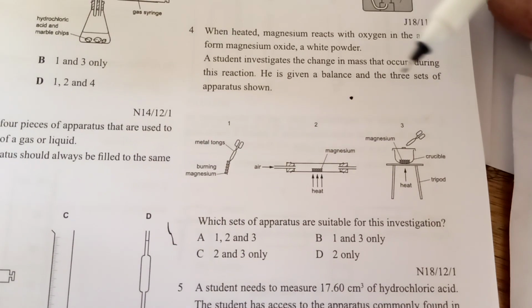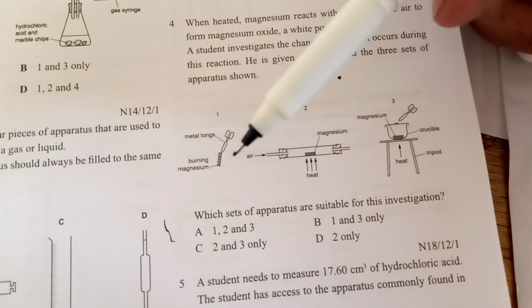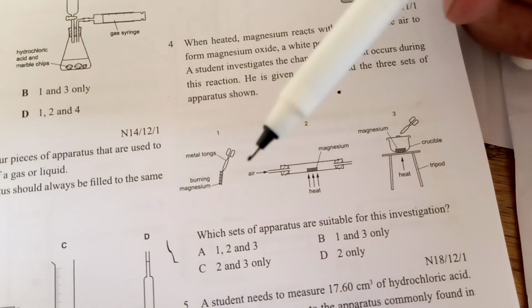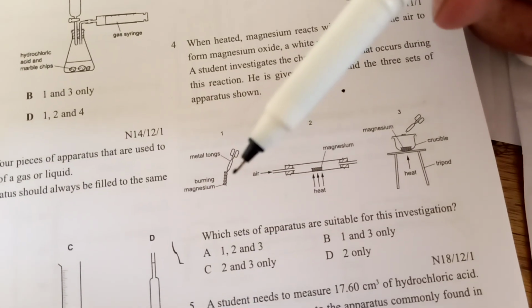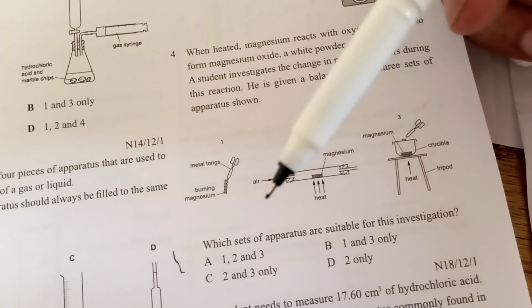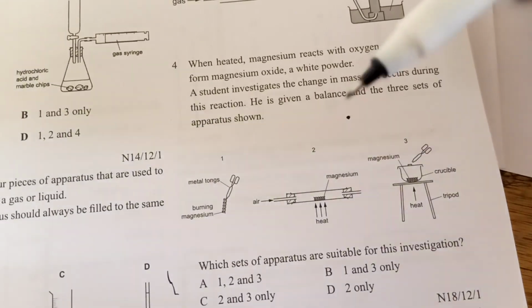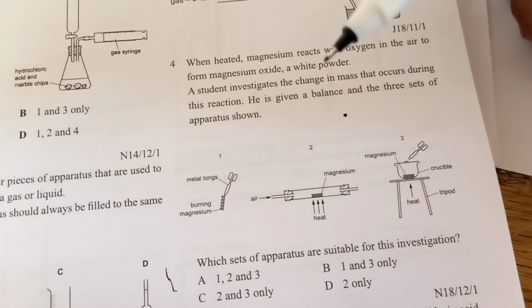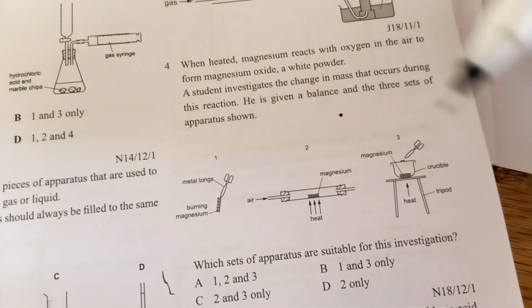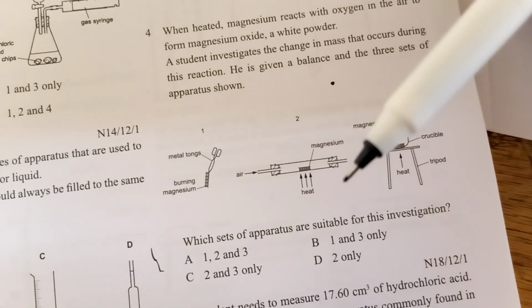A student investigates the change in mass that occurs during the reaction. So this is not a good method. We cannot take a metal tongs, hold a magnesium ribbon and burn it, because we are going to lose the mass. Because you are given a balance, for all these experiments we can find the mass. And this set of apparatus is wrong. This is wrong. This is a good method.